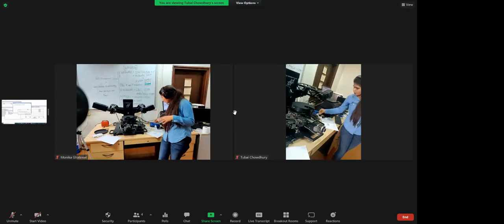It is not at all related with the roughness of the film. We are just making one side black, the lower side, and our sample will be on the upper side. There is no relation that darkening the lower side is related with the thin film roughness. To make an optically smooth film, you have to go for good methods, like there are physical methods.